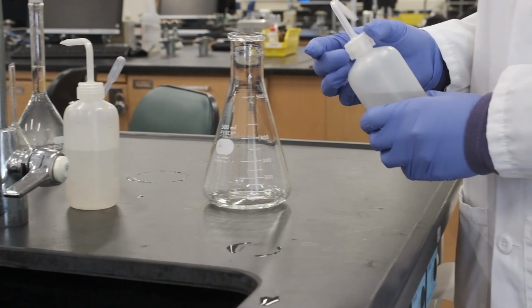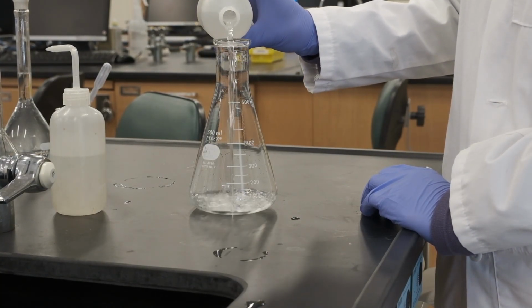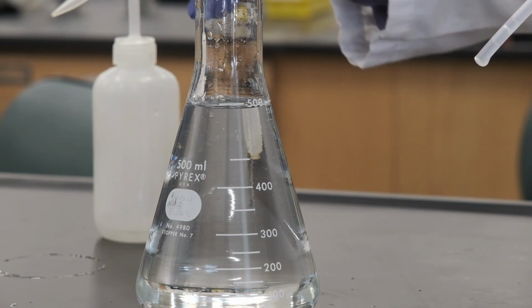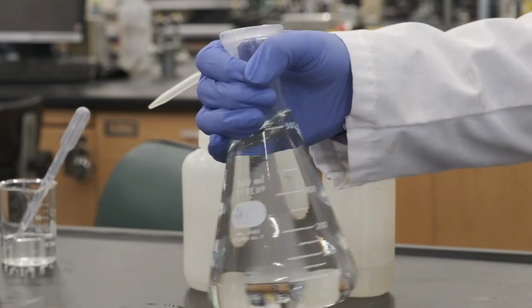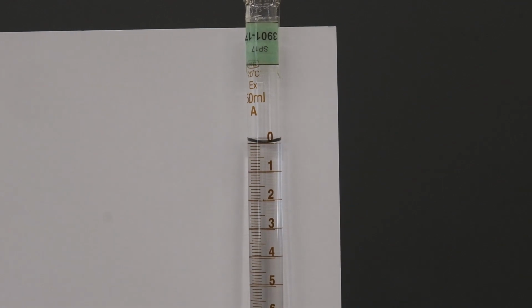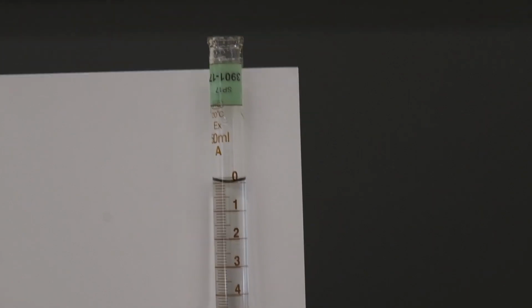We're going to add deionized water until the 500 milliliter mark. So after adding parafilm, we're going to swirl it. After conditioning our burette with the sodium hydroxide solution, we're going to fill up the burette until the 0.00 milliliter mark using a funnel.